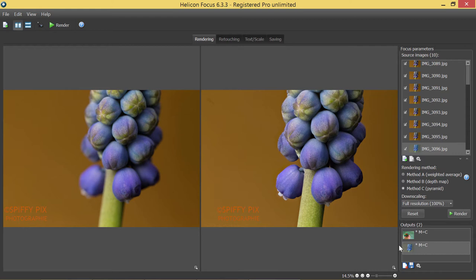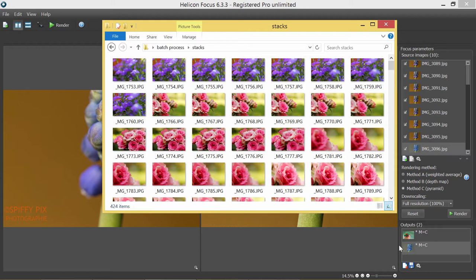Just as an example, this weekend I went experimenting with focus stacking and shot over 400 images. All of them are in one folder and now in order for me to be able to process stacks, I need to divide these hundreds of images into something like 85 stacks.